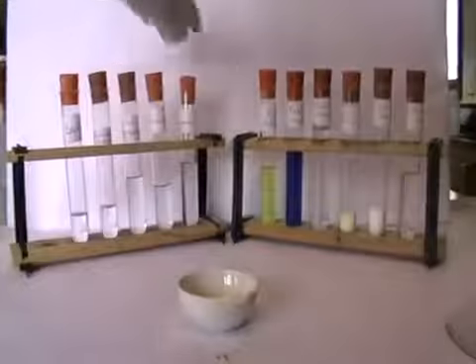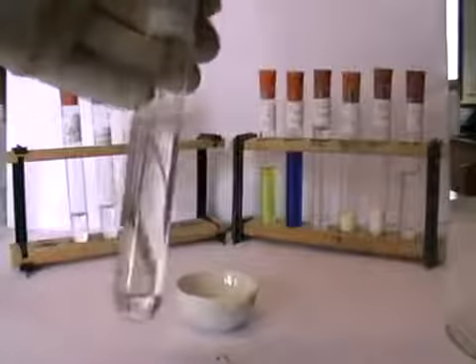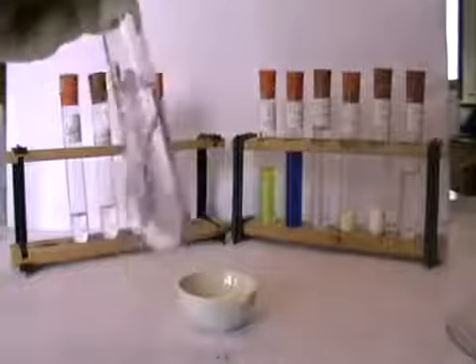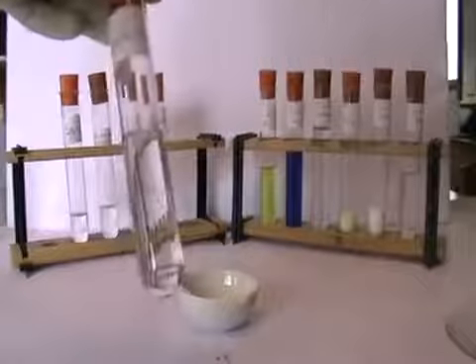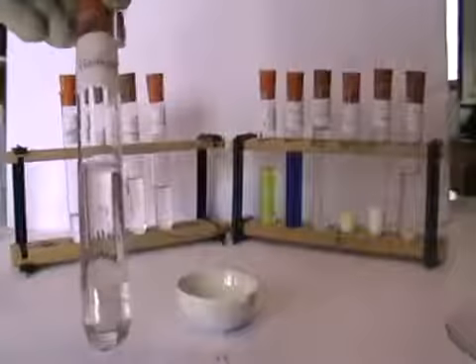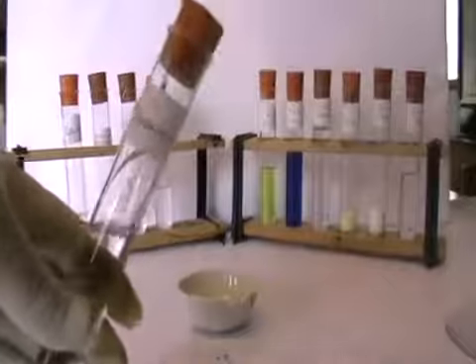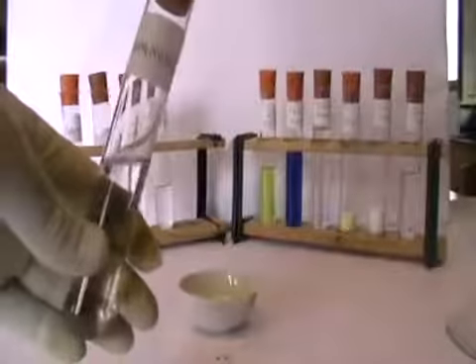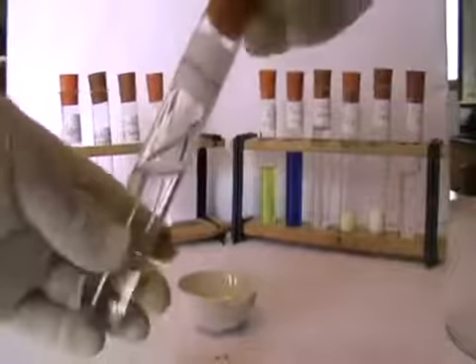And lastly, in this case, let's take a look at propanone. Here's propanone, a colourless clear liquid. Propanone apparently is a smell given off in the breath of people who might be beginning to suffer from diabetes, and during the famine, when people hadn't enough food to eat, it seems that this was also characteristic on the breath of people suffering from starvation. It's an indication that metabolism begins to change.